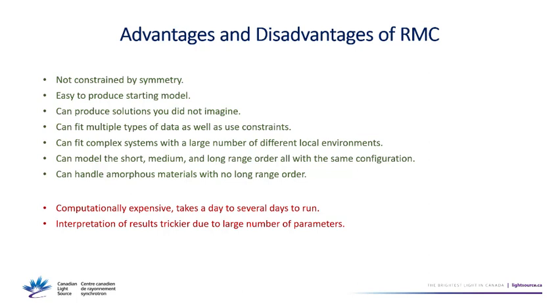I have a question about that. So you said it moves an atom essentially and then tests to see if it's better or worse. But there's 10 to the 4 atoms. Does that mean you're trying to converge in a space of 10 to the 4?